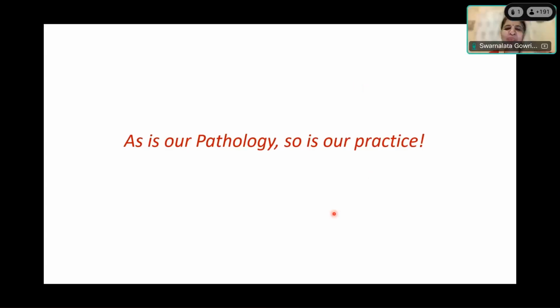We have one more last question, ma'am. What can be the best or ideal thickness for sectioning? Sorry, I didn't hear. Your voice is breaking, clear now. What can be the best or ideal thickness for sectioning? Ideal thickness for sectioning? Yeah, that's a good question.